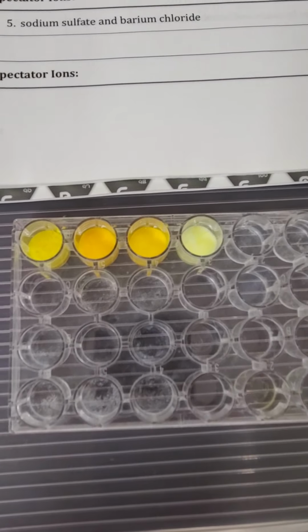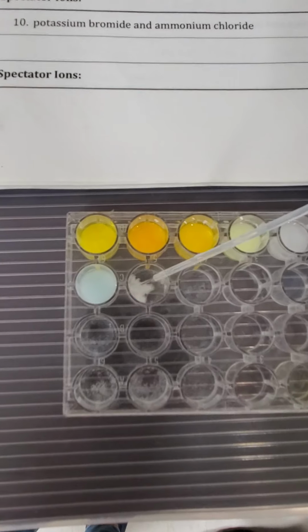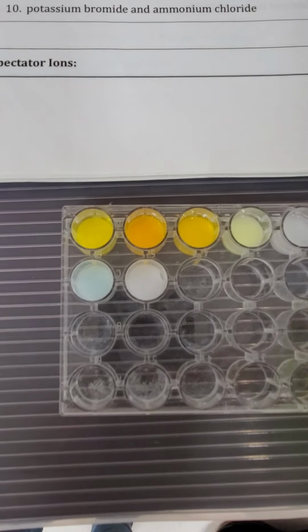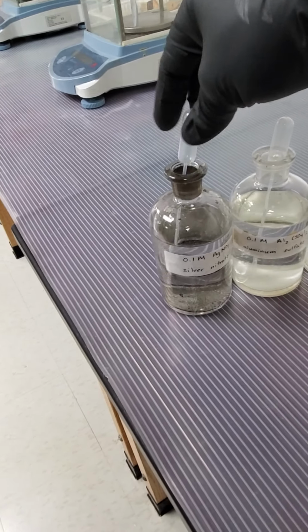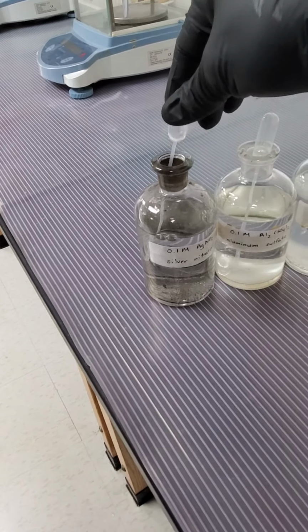And now barium nitrate. Next we have number 8, sodium chloride, so some salt water. And some silver nitrate. This is a chemical cauterizer. They put it around things like Mickey buttons and stuff, so it's not good for your hands. It likes to make your skin stop growing, at least for a few weeks.